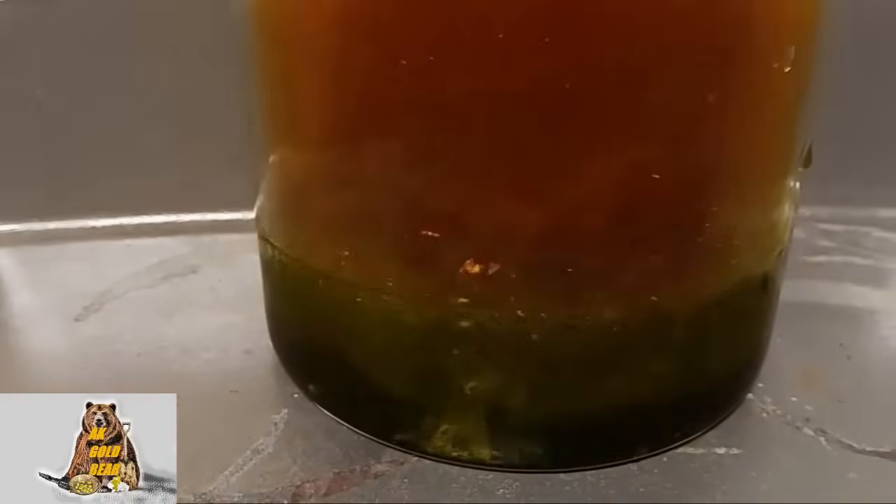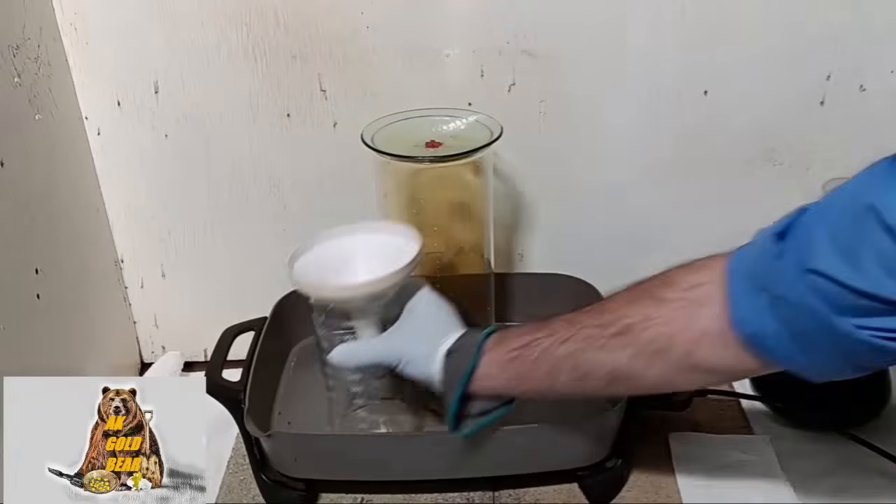Jesus, so many frags outside. All gold flakes dissolved.